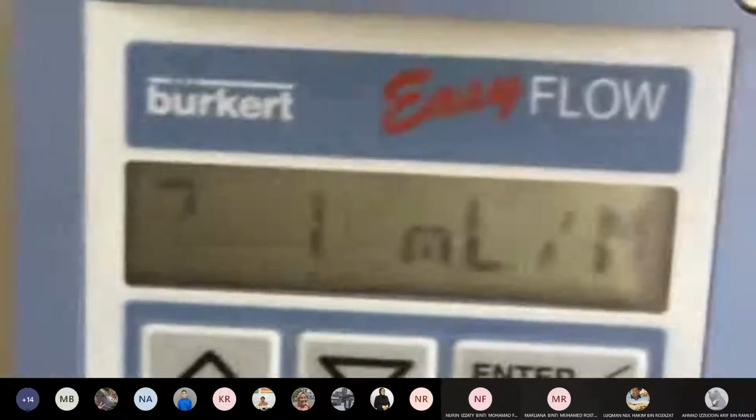Okay, so again, sama concept. I control flow rate here. I adjust flow rate. I read over here. So nampak sekarang bacaan dia. Okay, again, masalah dia, bacaan dia fluctuate. So itulah masalah flow system. We have difficulty in maintaining the flow rate. So flow rate berubah, residence time mesti berubah. So katakan kamu adjust residence time dia 5 minit. Tapi the real one kejap 5 minit, kejap 4 minit, kejap 6 minit. So dia tak accurate sebenarnya.